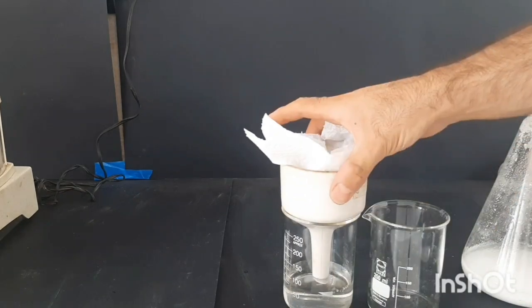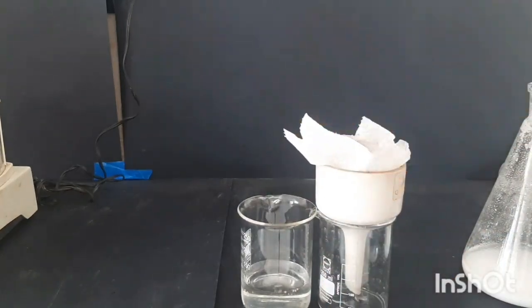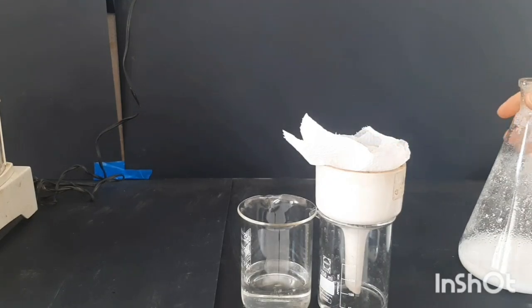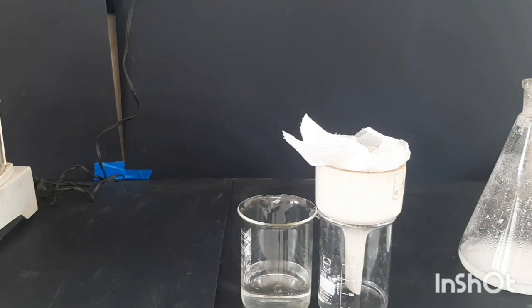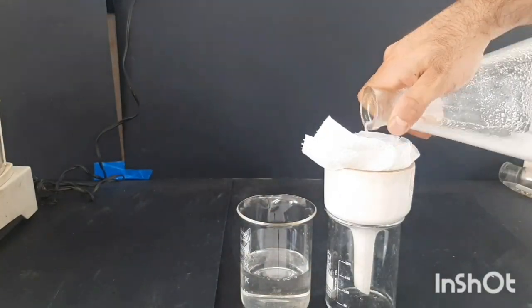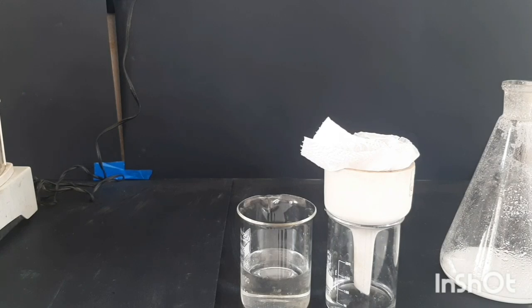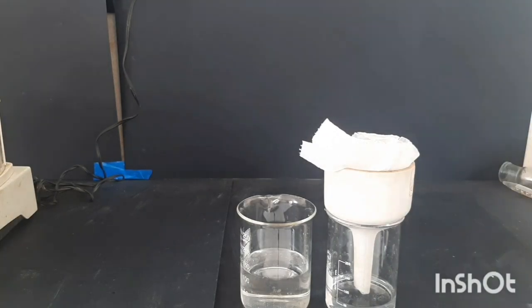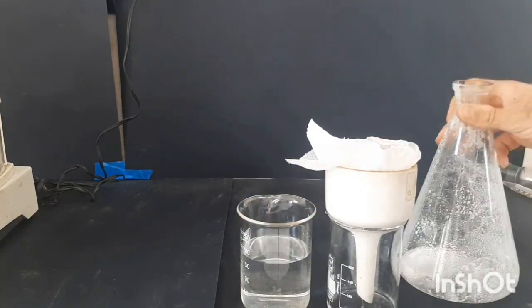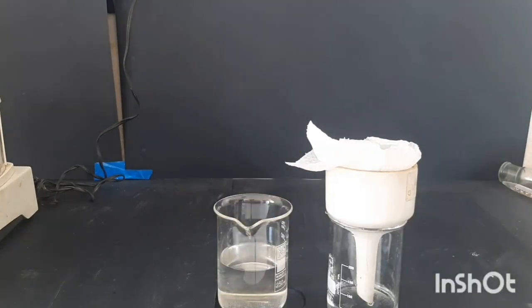Filtration was good. You can see the water passing through is clear, but paper towel is not a good medium for filtration as it tends to tear up, and maybe it might have some plastic covering to dissolve in your mixture. I don't recommend it. The water passing through had an awful smell, almost like some kind of biological waste, and it was discarded.